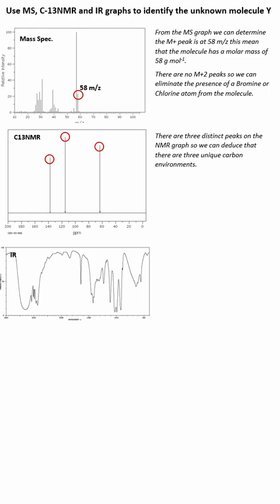Now if we look more closely at where these peaks are, we can see that there is a peak at 62 parts per million. Because it's at 62, we're going to think that that's very close to the range where the carbon environment is attached to an oxygen. The oxygen has shifted it further up the range here. So we're going to write that down: there's most likely a carbon-oxygen bond, usually between about 50 to 60, but around there, around the 60. And then the other 2 here are within the range of, I guess, 100 to 140.